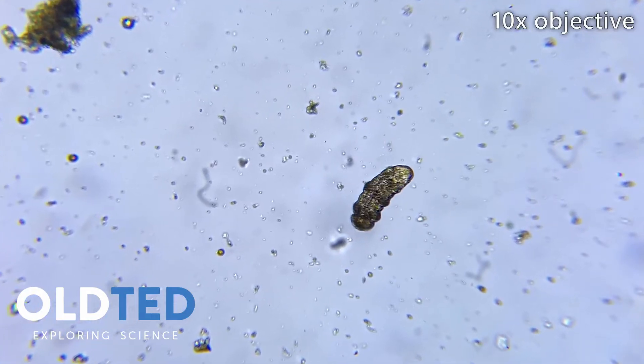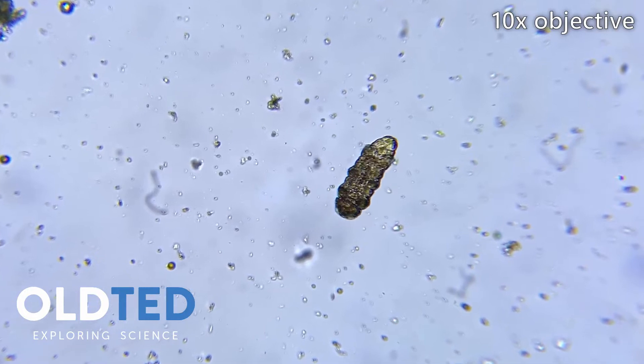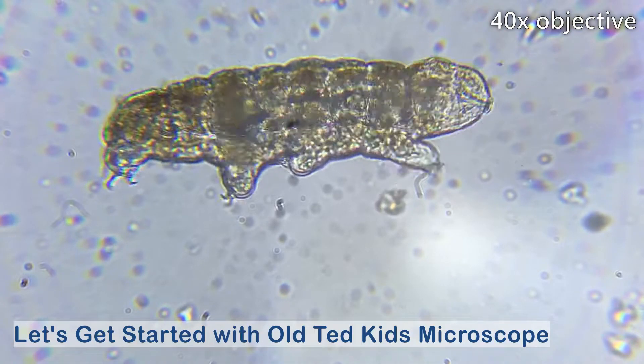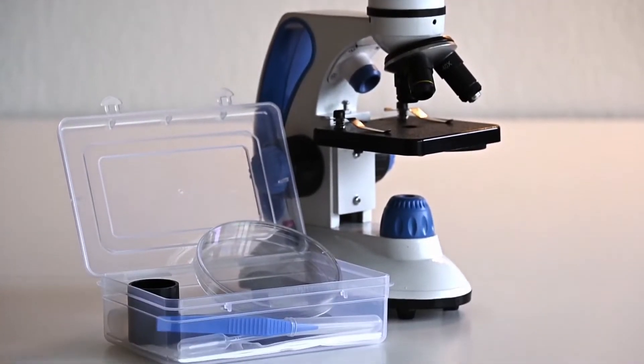This is a tardigrade, also known as a water bear. It's one of the smallest animals on the planet. Today I'm going to show you a fast and easy way to find them using the Old Ted Kits microscope and the included lab kit.